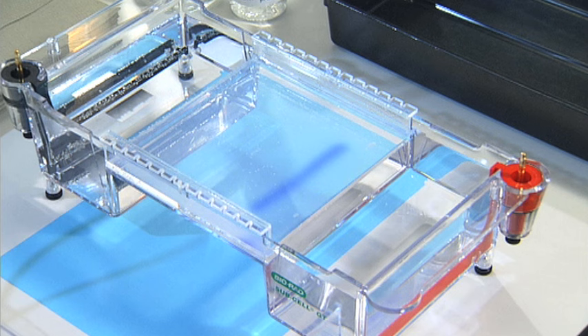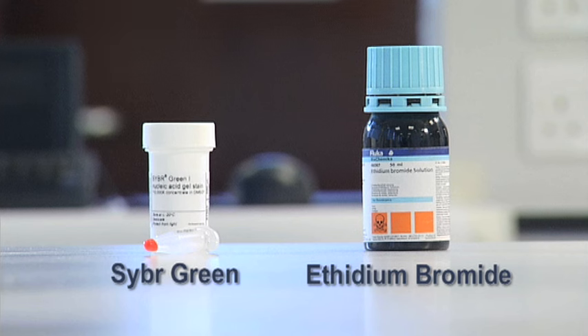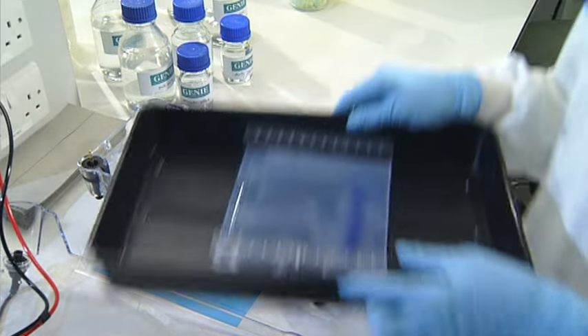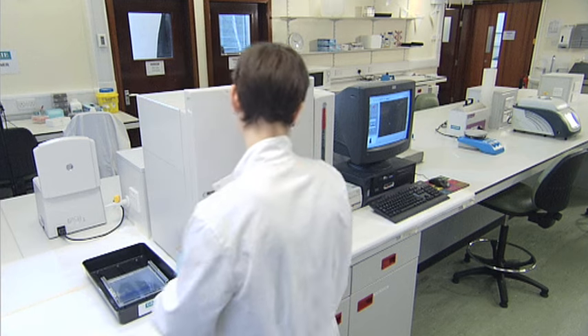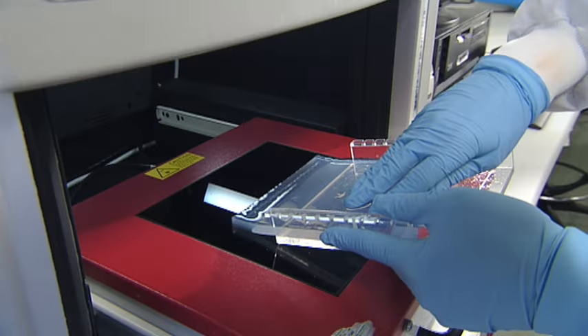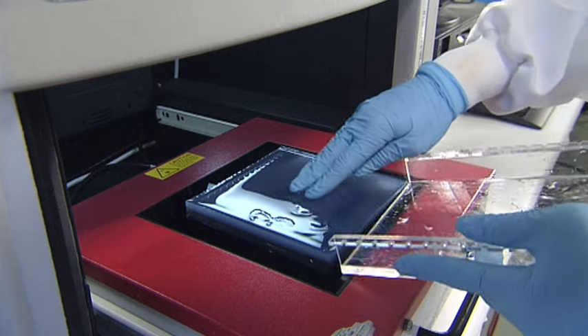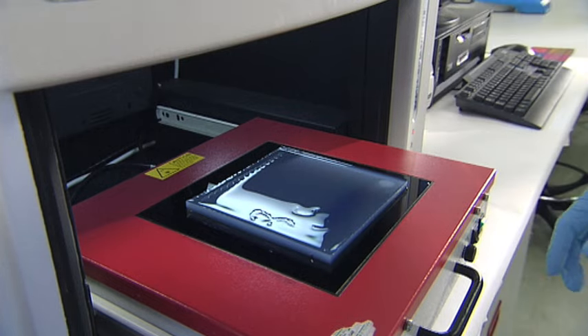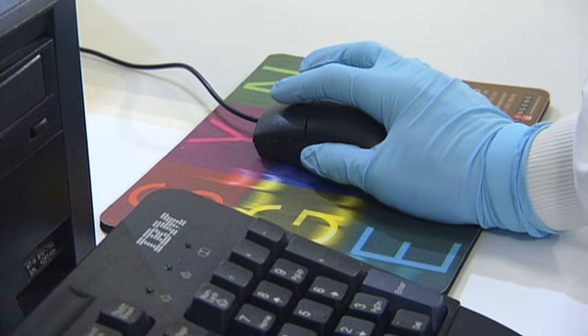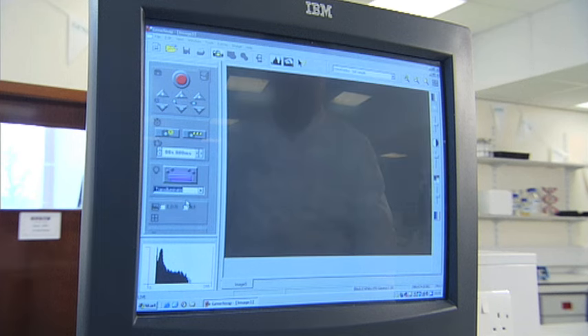Once the fragments have separated sufficiently, it's time to visualise them. This is done with chemicals added to the molten gel before it was poured. SYBR Green dye can be used, but the most commonly used chemical is ethidium bromide. These chemicals stick to the nucleic acids and fluoresce under ultraviolet light. SYBR Green is safer but less sensitive than ethidium bromide, which is a strong mutagen. To have a permanent record of the fragment separation, you need to take a photograph by placing the gel on a UV illuminator inside a box containing a camera. The illuminator is switched on, the gel image is displayed on a computer screen, and the image can then be saved as a digital file or printed out.